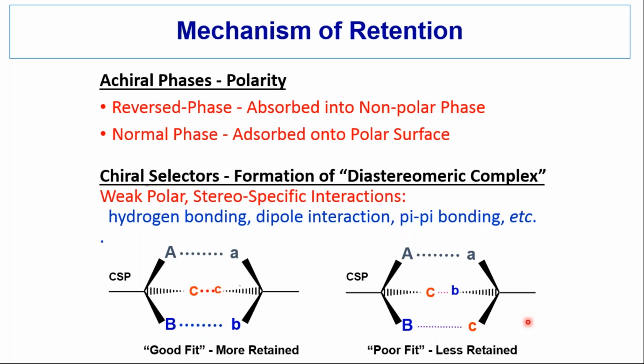If the fit isn't so good, we may get retention from, say, the hydrogen bonding, but the pi base and the dipole may not fit as well as the pi acid and pi base, and same thing here with the pi acid and the other dipole, and so we may get less retention, a less good fit, and so it's less retained. Good fit can sometimes come at a price.